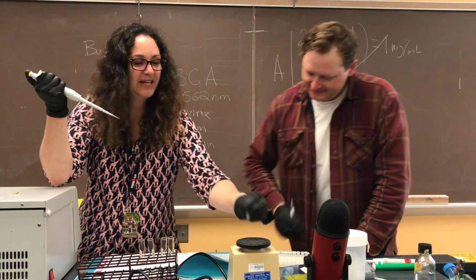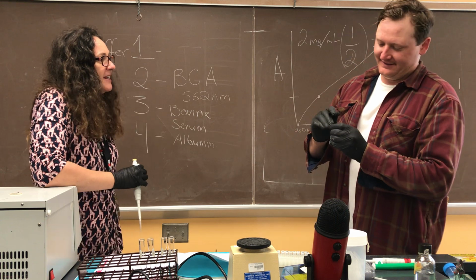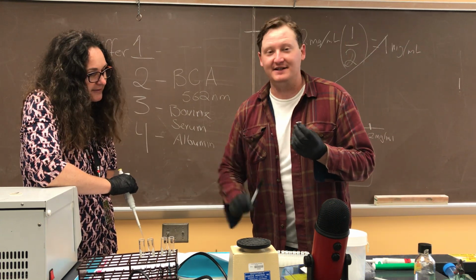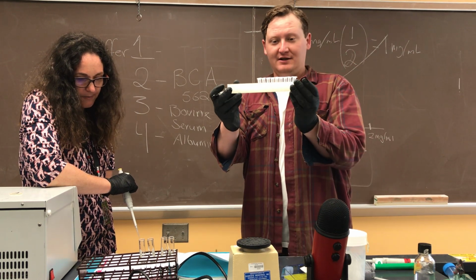Alright, so we have made a dilution series of doubling dilutions. They are labeled. We have a corresponding table telling us what the concentrations are now.